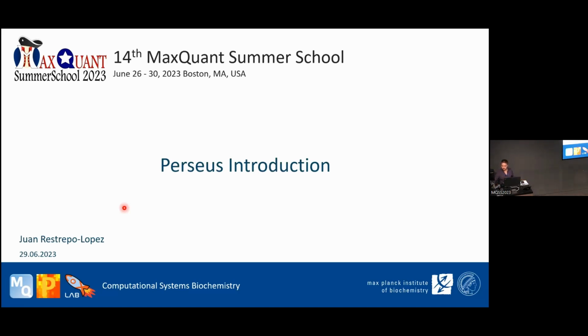So it will be a lot of fun, and we will start with a short introduction to the theory behind it, like all the statistical models that we use and all the math concepts behind it. Then we will do a hands-on presentation, let's say, or training about how to use the basic features of it, and then more advanced ones.